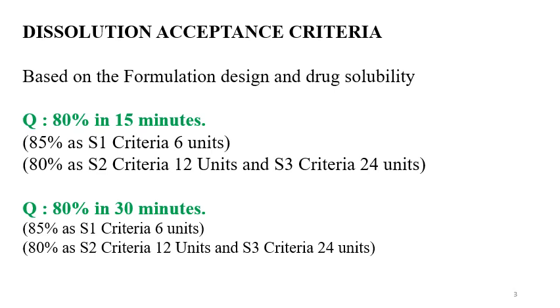Also, the stirring speed can be increased to improve the percent drug dissolved in 15 minutes or 30 minutes. So it is very important to understand what the standard or mild conditions for dissolution testing are and what the acceptance criteria for IR formulations are.